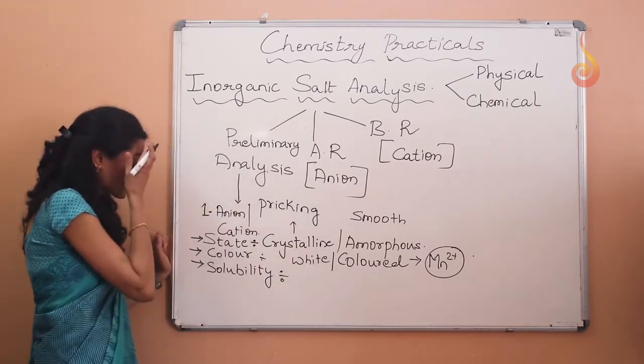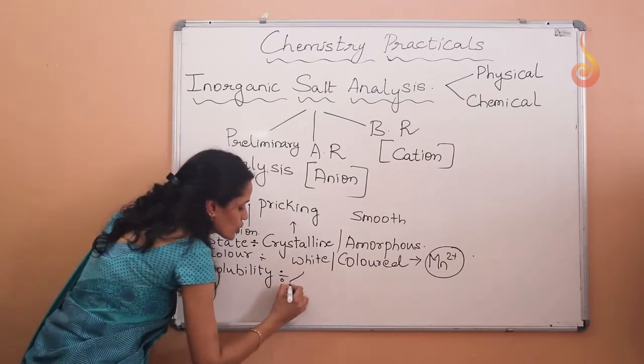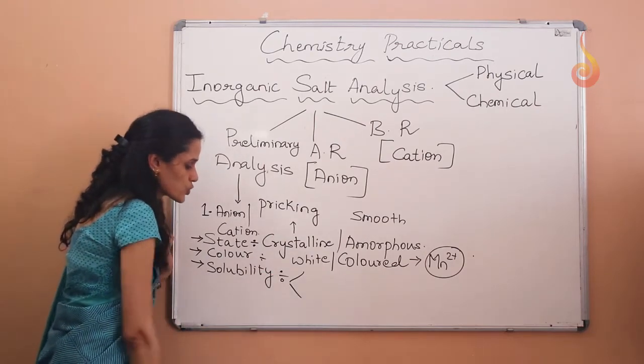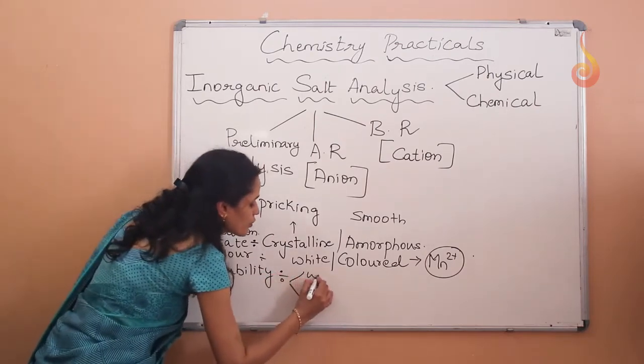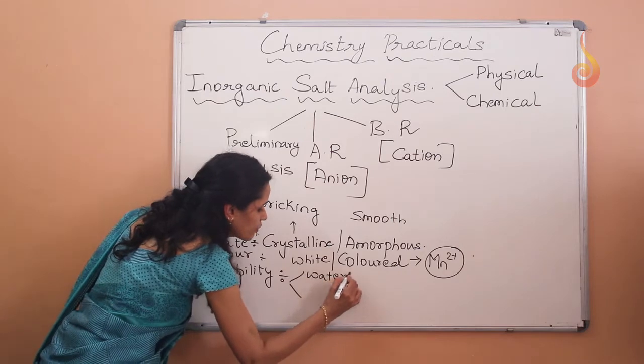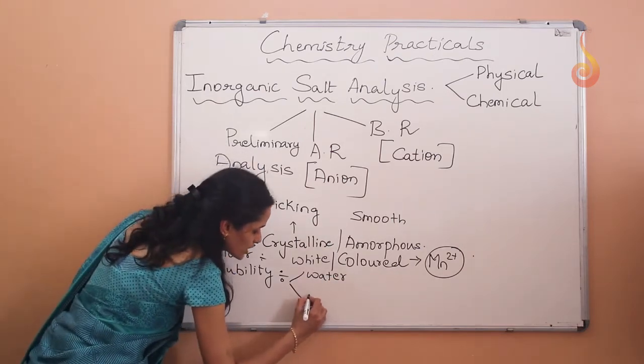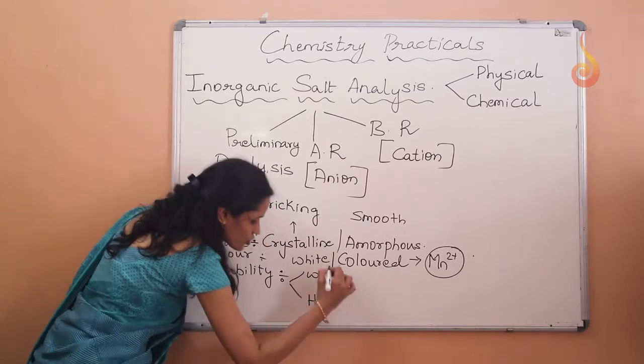In case of solubility, we use 2 different types of solvents. Firstly we'll go with water, and then we'll go with HCl, hydrogen chloride.